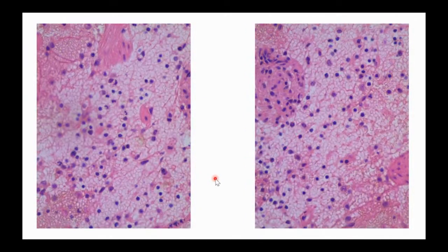I believe this is the last type of tissue I'm going to show you today. This is the type of tissue called reticular connective tissue. Reticular loose connective tissue. See how well I can do this. Reticular. Remember from our earlier discussion about areolar connective tissue that reticular connective tissue kind of looks like a net. So see all these little areas where you can kind of see this net or kind of bubbly looking appearance here? Those are my reticular proteins. So reticular proteins branch a whole bunch. They're really good at filtering things.